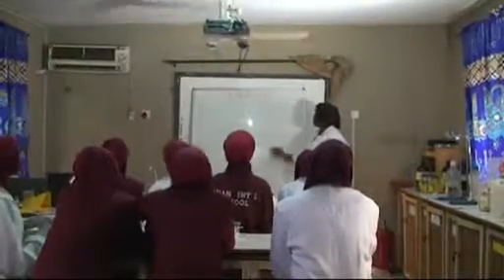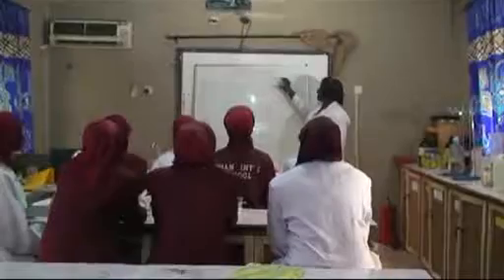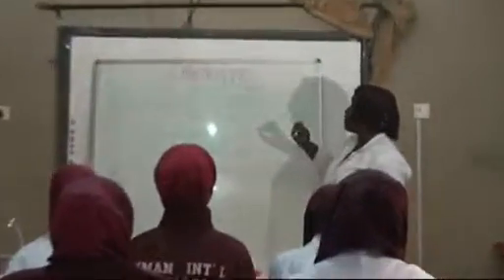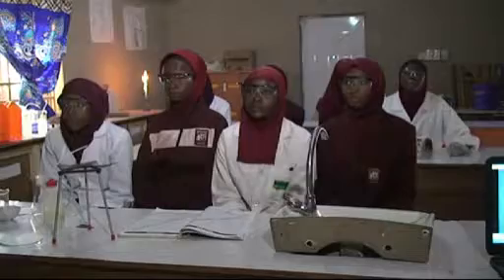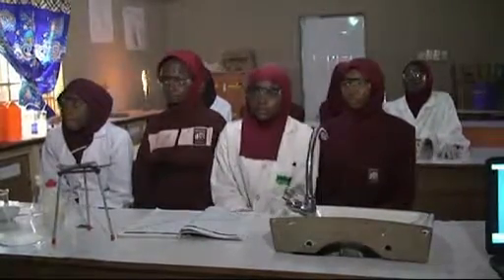Today we are going to learn a practical in chemistry that states separation techniques. From this topic, separation techniques, we are going to focus on filtration and evaporation. This separation technique is going to teach you how to separate mixtures that do not have chemical bonds between them.